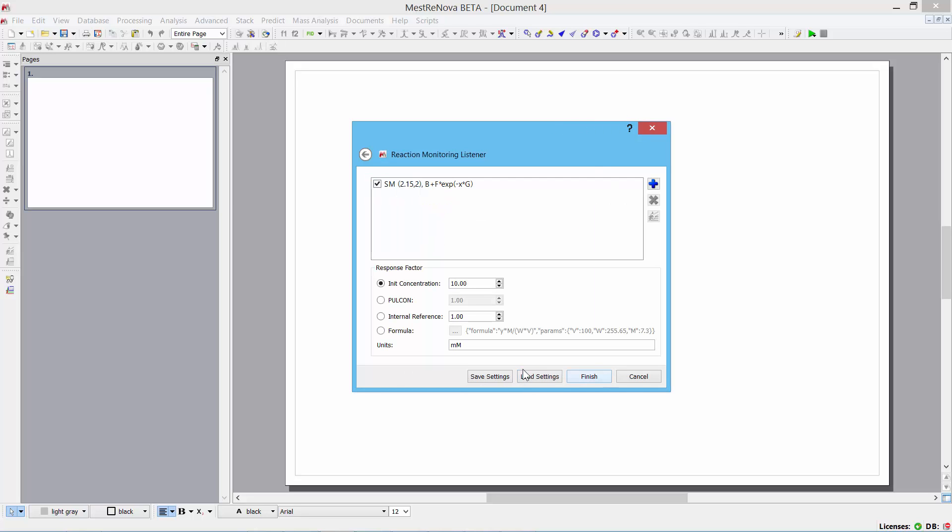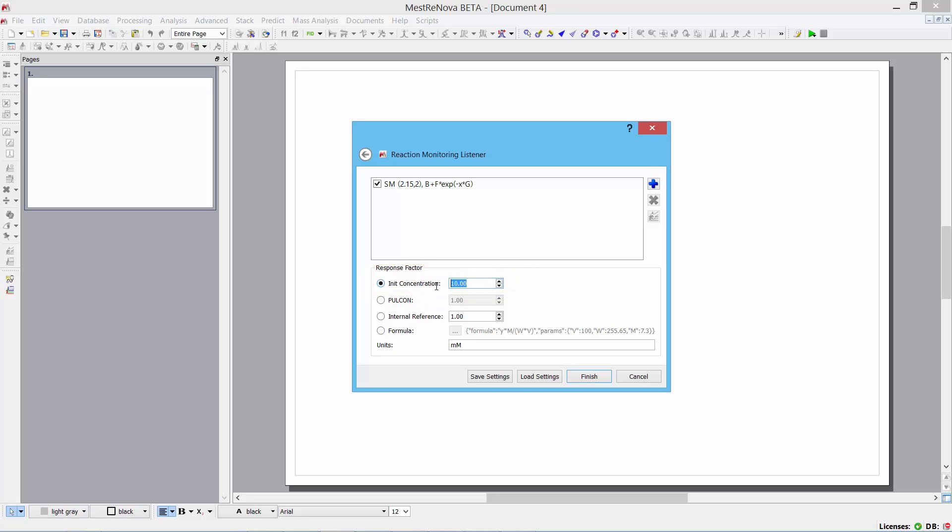And moving to the next screen, this is an important one because here at the bottom section, I can specify some conditions that relate to the way in which the integral information is converted into concentration information. So, for example, what I'm doing is that I'm specifying that the initial concentration is actually 10 millimolar.